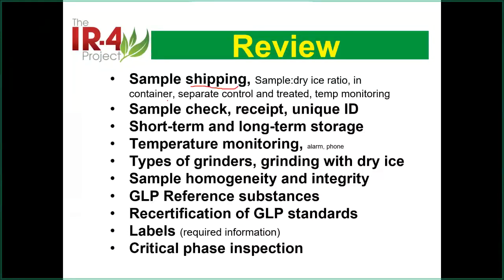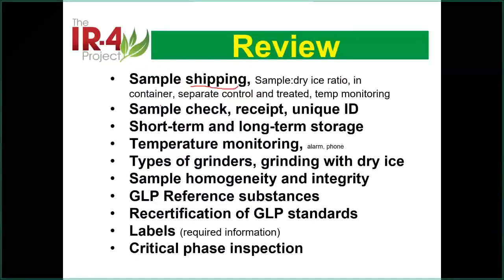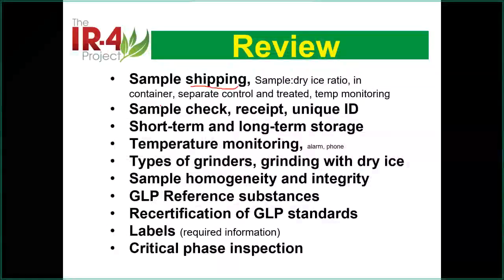But sometimes if you ship with dry ice, then in this case, we do need to put enough dry ice there, and I put the recommended ratio there, which is 1 to 4. So 4 is the dry ice by weight.